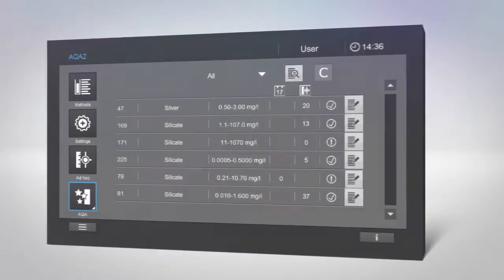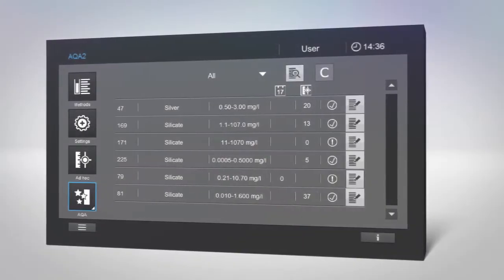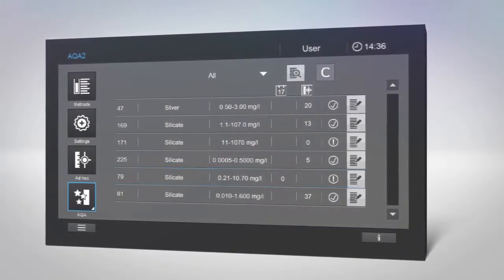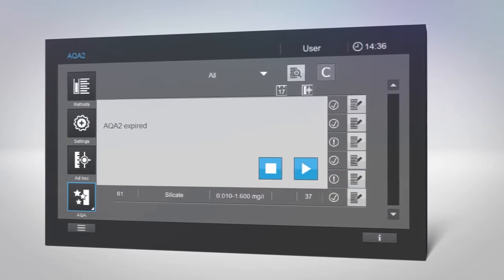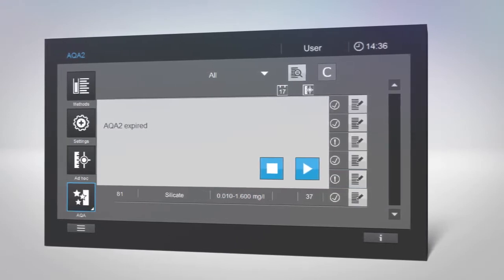If you are about to perform a measurement using a method for which you set an AQA, you will be notified if the AQA has expired.